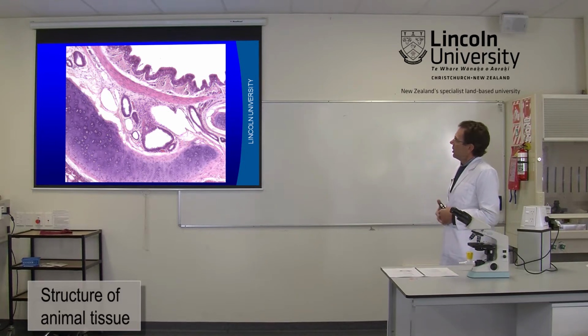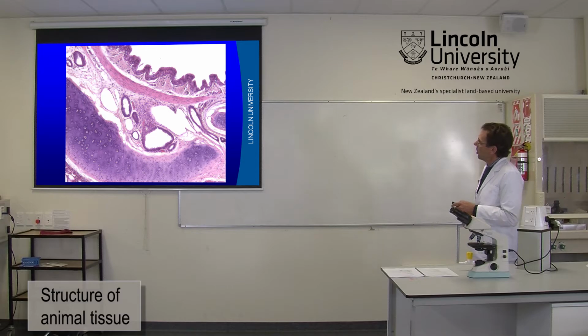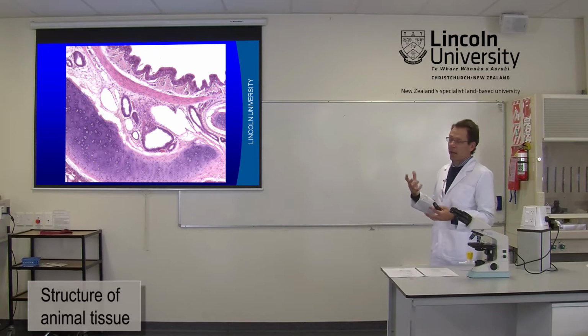So going back to that larger airway, the bronchus, here we've got a higher magnification, so this is the air here, this is the lining of the airway, and you can almost see on the lining it has a slightly hairy appearance. There are cells in this lining of the airway which secrete mucus onto the inner lining of the airway, and these tiny little hairs on this lining move that mucus continually out of the lungs.